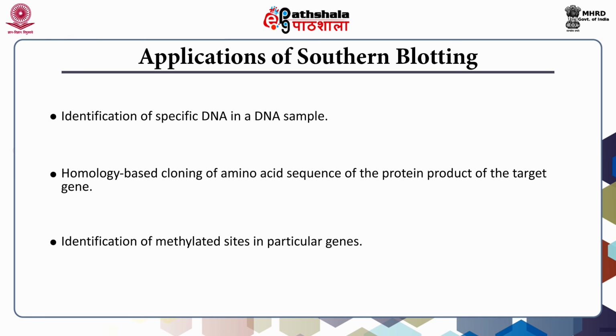I must tell that during the 1980s and 1990s, the technique of Southern blotting was very widely used in all molecular biology labs, biotechnology labs, and even biochemistry or any branch of life sciences.